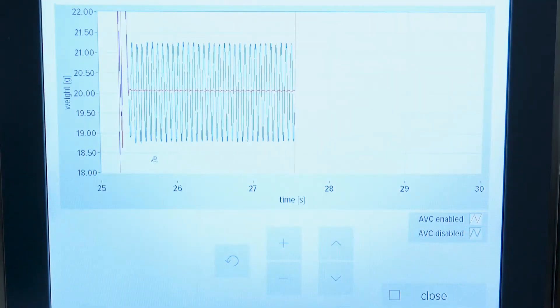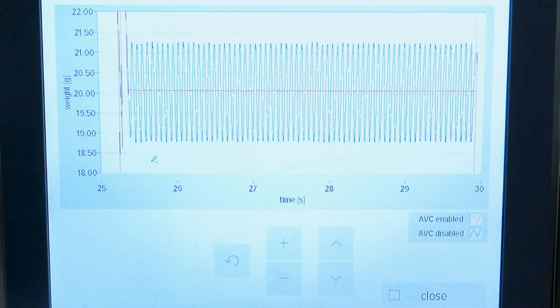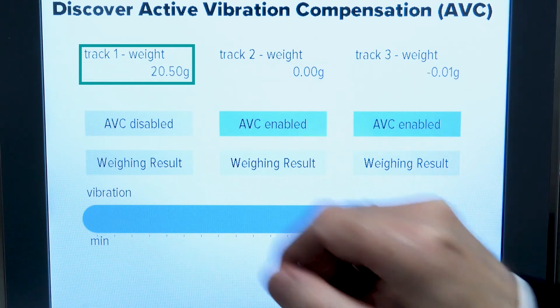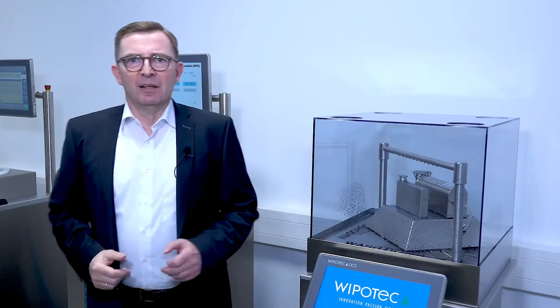The blue graph demonstrates the weighing result without ABC, and the red line shows the performance of the weigh cells with ABC switched on — a huge difference in performance. You can also see it in the jumping weight display, which represents the graph we have seen before.